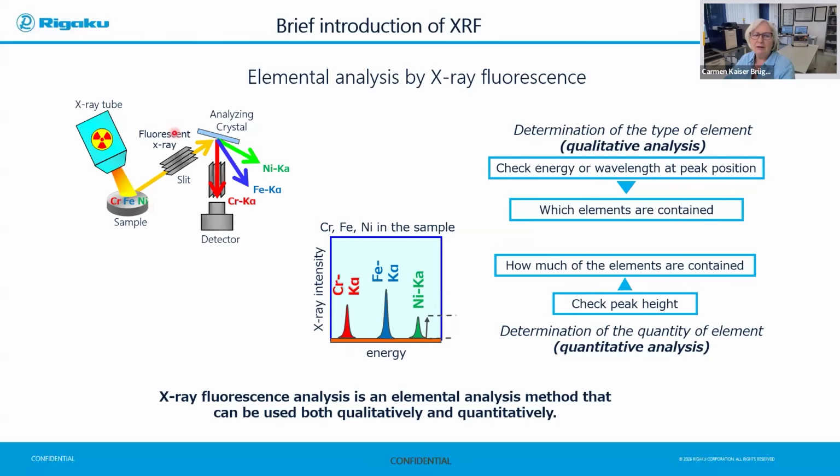And these are the X-rays that we will then collimate or focus onto a specific analyzing crystal for WDXRF. And we will get these characteristic K-alpha lines, which we can either measure basically quantitatively with the calibration method, or semi-quantitatively or qualitatively to see the presence of particular elements.